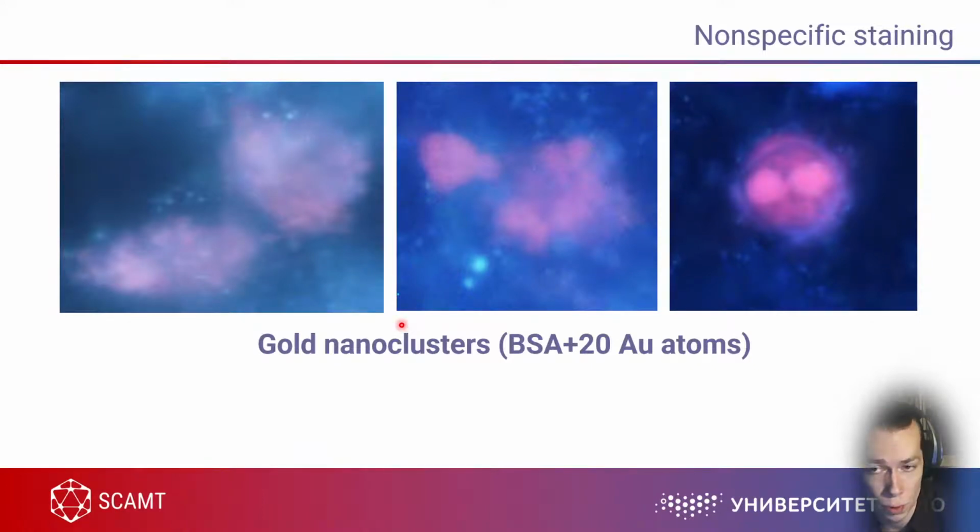So, what do we observe here? We observe non-destroyed nanoclusters with still a red fluorescence. We observe some exosomes or endosomes or endolysosomes with destroyed clusters with blue fluorescence. And all of these small structures, here you see a lot of blue dots, probably it's exosomes or endolysosomes, something like this.